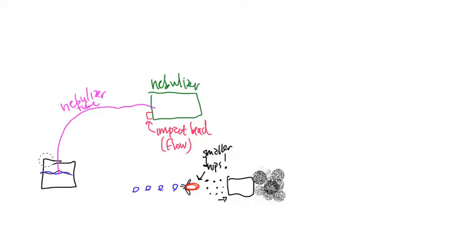So with this nebulizer, you have to think of yourself at an amusement park. On a really hot summer day, sometimes you go under those covered areas of the amusement park and you are sprayed with a very fine mist. It's not really water, right? It's not going to get you soaked. It's just a very fine mist that will cool you off a little bit as you spend the rest of your day at the amusement park. The same thing is happening here.